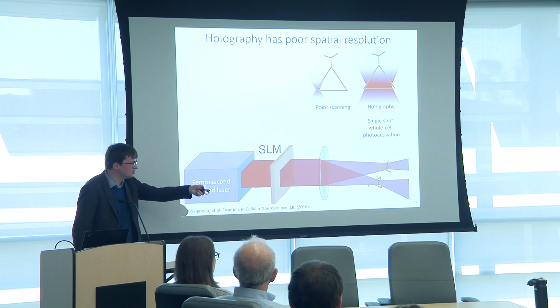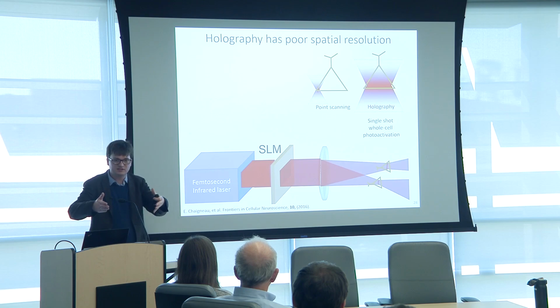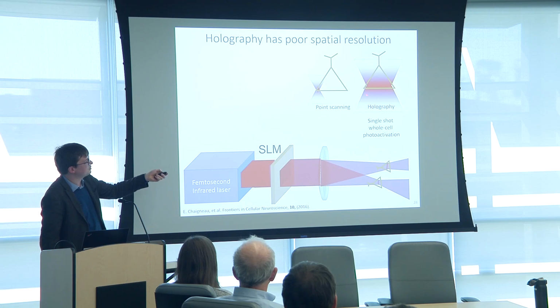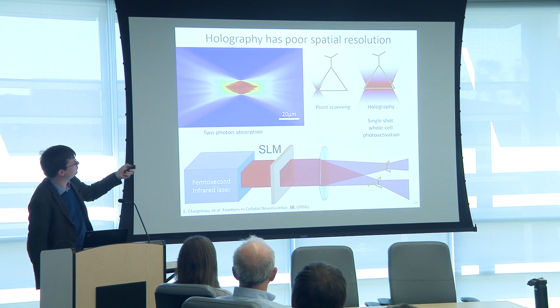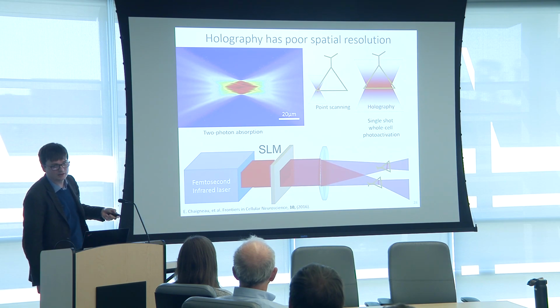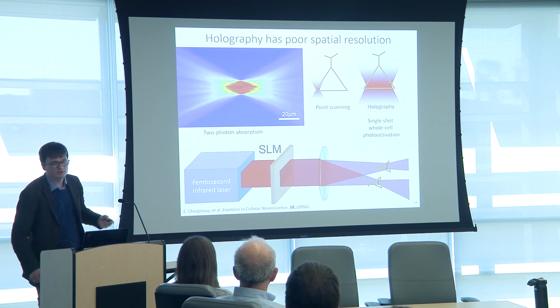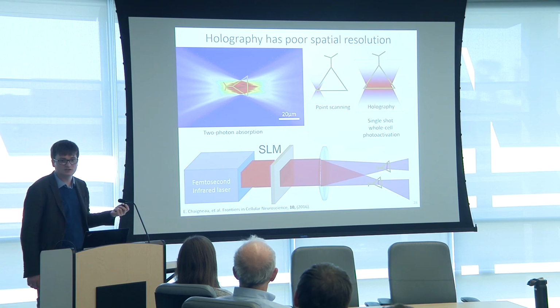However, because of that drawing that I just did here, as you cover a larger area, because the photon flux is still the same across this whole beam that focuses across there, the two-photon process is actually extended, and the number of photons that are received here and there changes. For instance, this is a map of the two-photon excitation process, as you increase the size of the covered area, the extent along the z-axis, so I should have flipped this image, is actually growing, which means that if you have, for instance, a neuron that's here, great, the neuron receives plenty of light and the excitation is going to be strong, but if you have a neuron above and below, you're also likely to excite it.